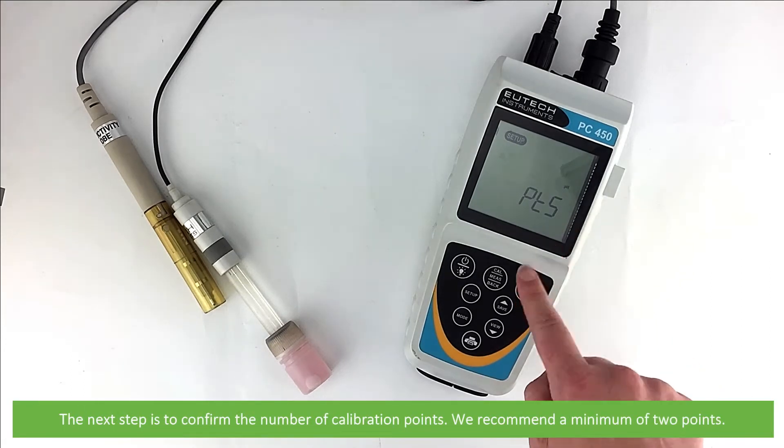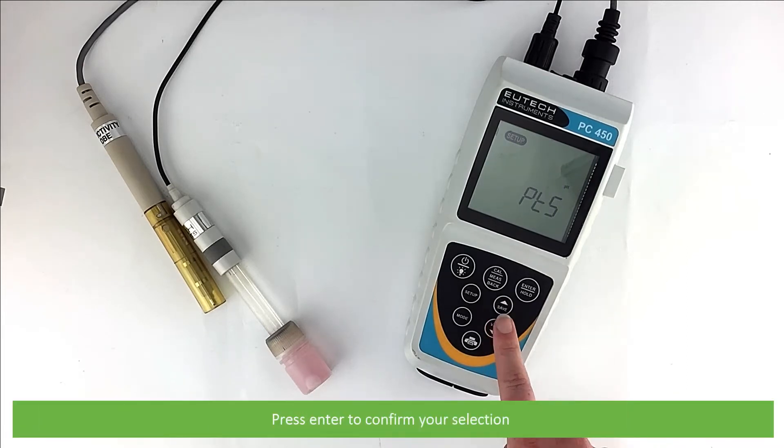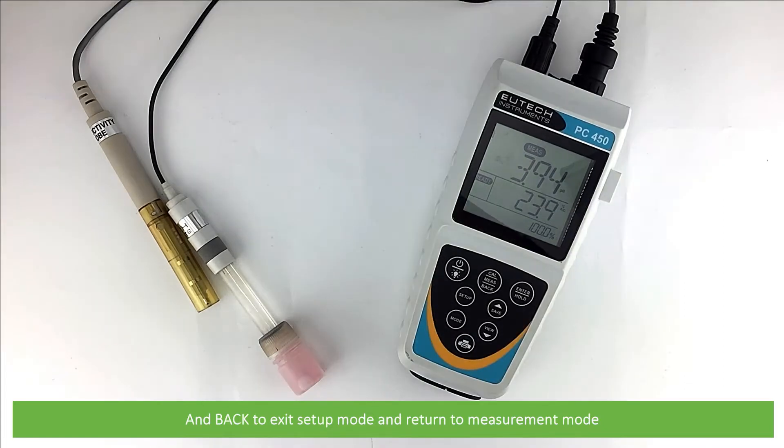The next step is to confirm the number of calibration points. We recommend a minimum of two points. Press Enter to confirm your selection. Once finished, press Back to exit Setup Mode and return to Measurement Mode.